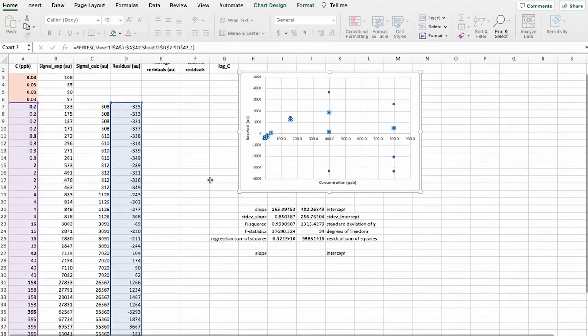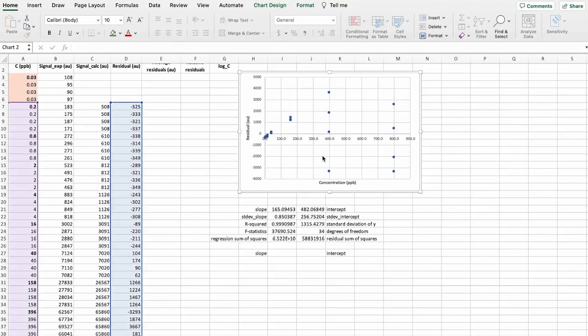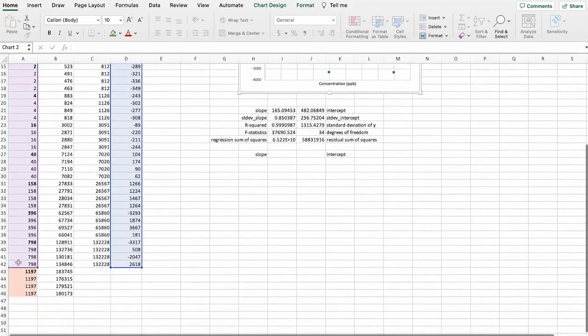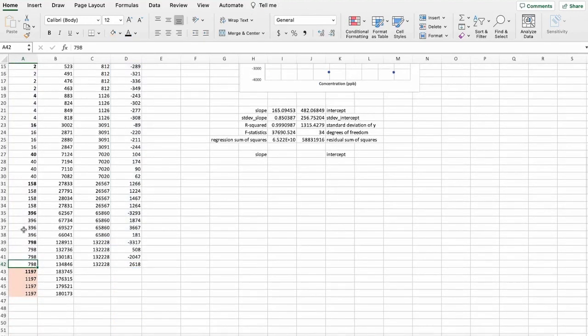And let's mark all this area that we think that is linear. So from 0.2 to 798. And we can see right away from here that these two highest concentrations are actually not linear. And we should also leave these out.